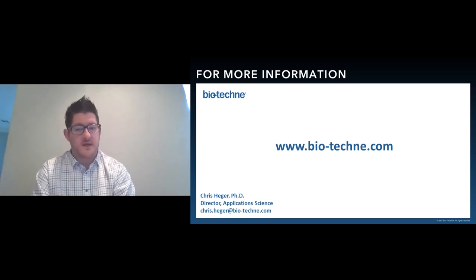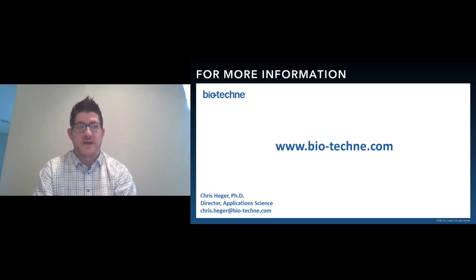So AAV2 has been shown a number of different ways to be roughly 7 to 1 to 1, like we showed today. AAV9, for example, is closer to 14 to 1 to 1. I showed an example of that where we measured it to be 11 to 1 to 1. So it definitely varies between the serotypes, but we can actually accurately measure it. That's what's important.